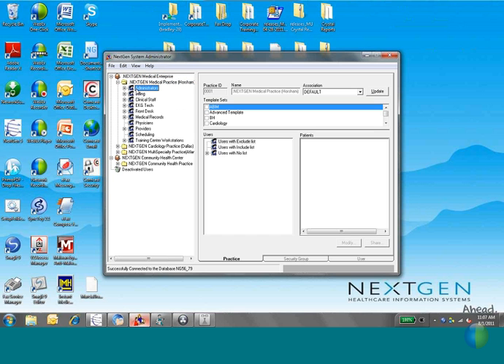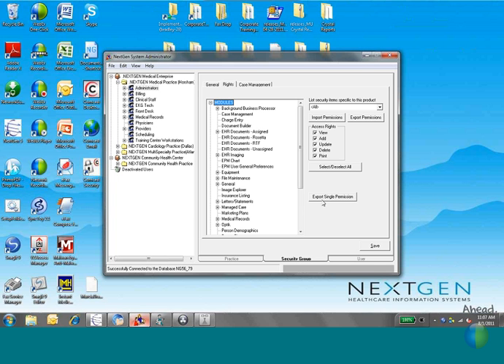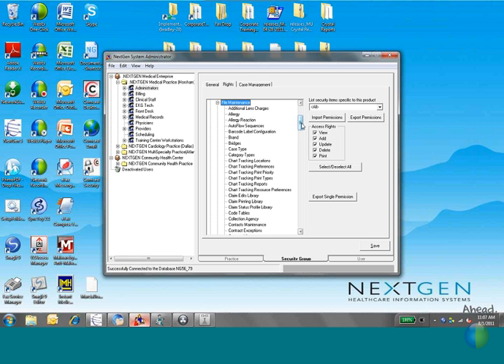The security rights, of course, if you access your group and then you click on rights, there are a couple rights under the modules and a couple under operations. First, what you're going to see is that specifically there are many file maintenance tables for the order module. So under the file maintenance security rights section, you want to make sure anything with the word order in it, like these here, has the proper security rights for the people that will be involved in the setup. Those people could be completely new people from what had been done previously in file maintenance, so that's why you want to be sure that you have all the right people accessing what they need to access.